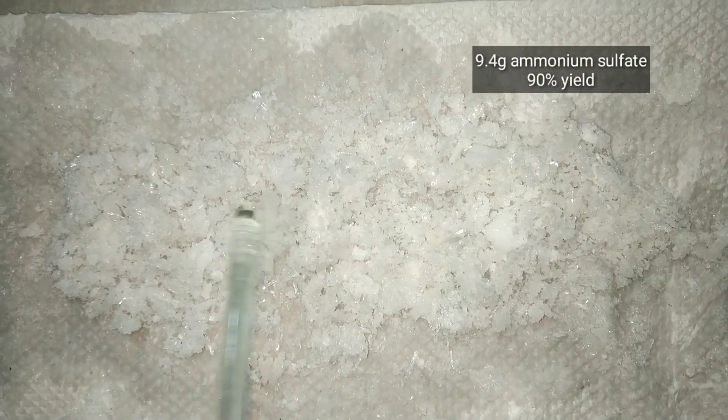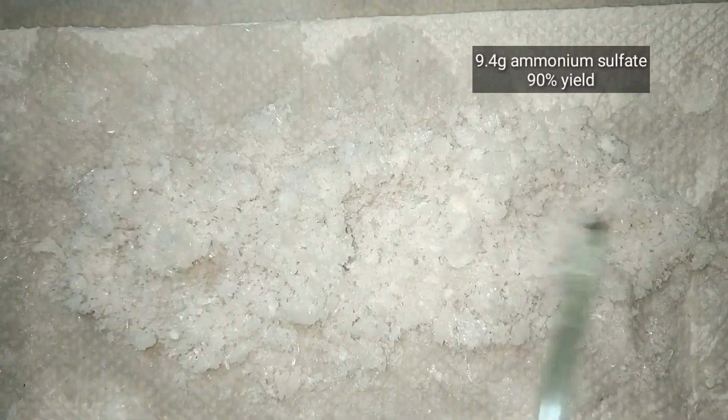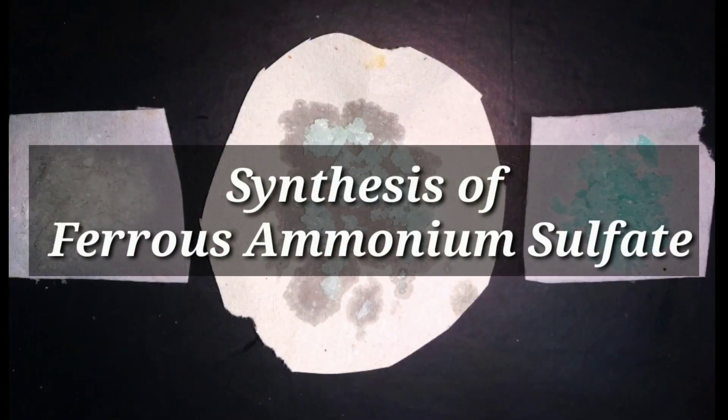After drying the crystals I crushed them and this is the final yield. I got about 9.4 grams. Now we will be synthesizing the ferrous ammonium sulfate or the Mohr salt.